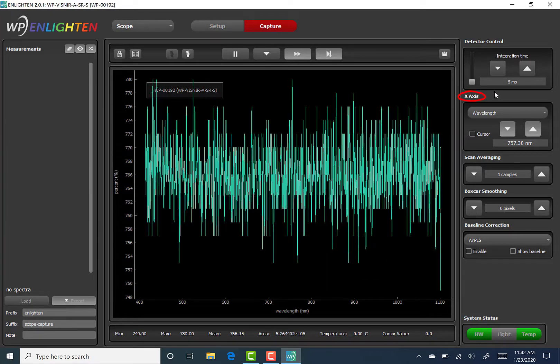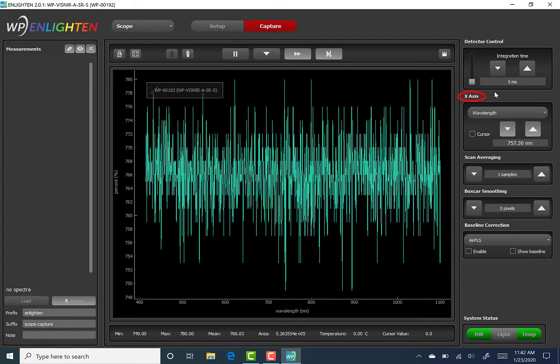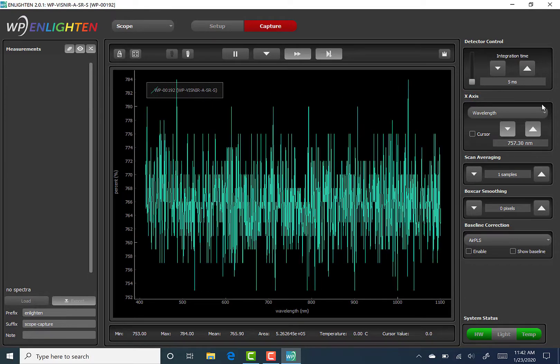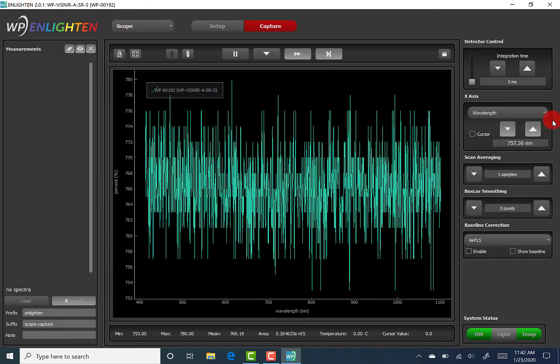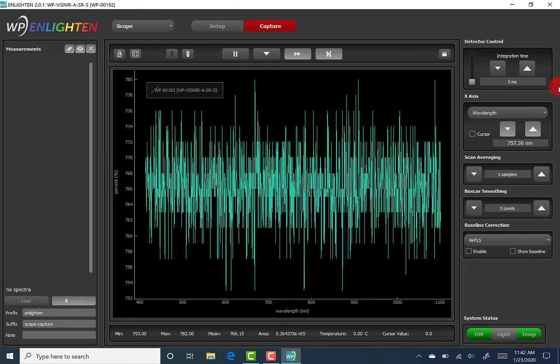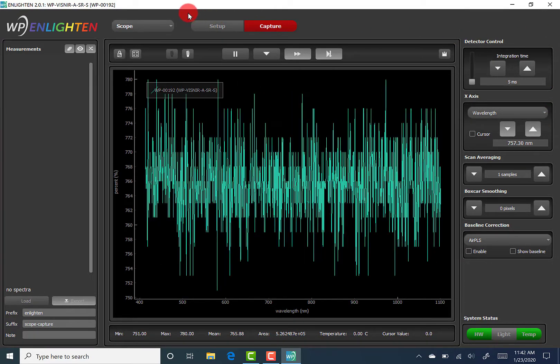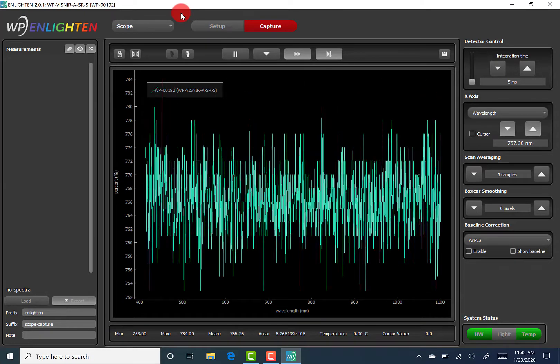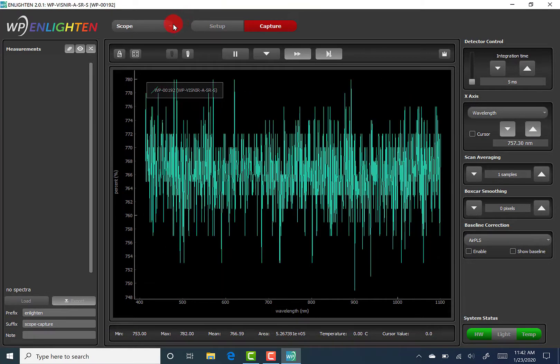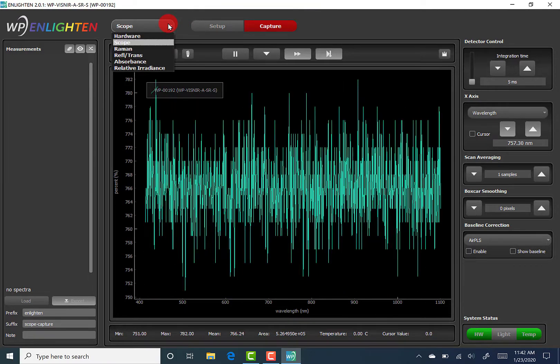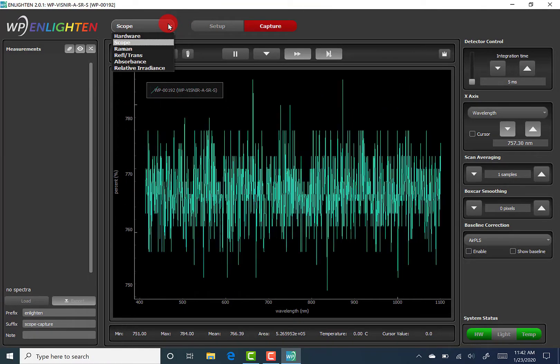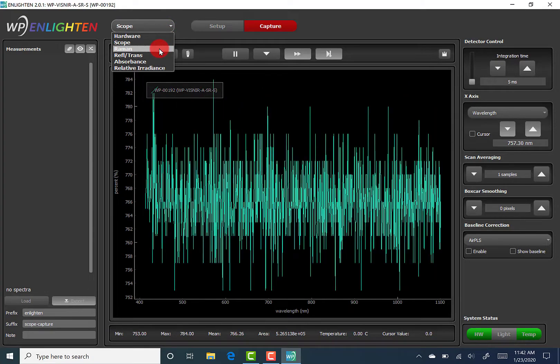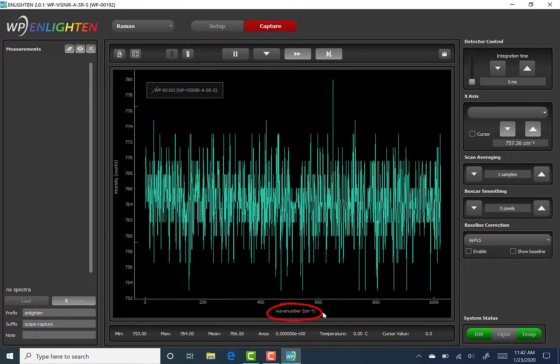The X-axis feature allows the user to select the units of the X-axis displayed on the spectrum chart. Clicking the drop-down arrow reveals options. Switching the spectroscopic techniques and operating modes from the drop-down menu above the spectrum chart will automatically reset the axis to its default setting for that particular technique. For example, the X-axis for scope, absorbance, reflectance, transmission, and relative irradiance is wavelength, while the default X-axis for Raman technique is wavenumber.